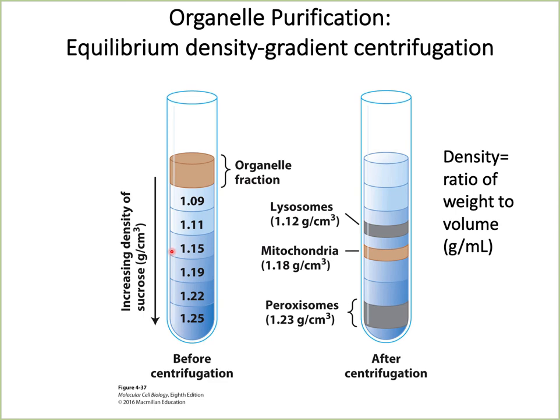One of the common materials is sucrose, but we can also use cesium chloride, a very powerful gradient maker, or a Ficoll gradient. There are many different commercially available gradient makers, but sucrose is a very common one and readily available.